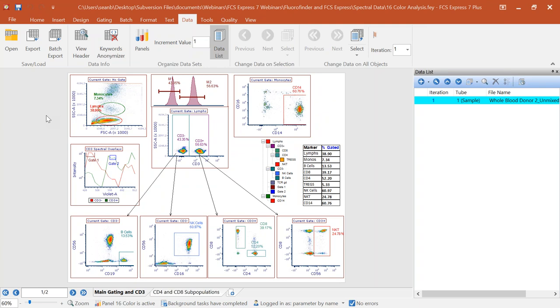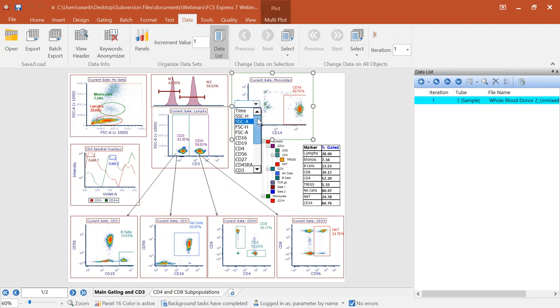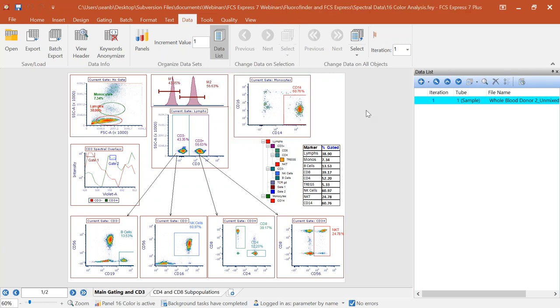The spectral data set we're going to work with today, if we look at the header for this data file, you can see it's from a Cytek Aurora. One of the most important things you're probably thinking is — this just looks like regular flow cytometry data. And it is. One of the really nice things about working with instruments like the Cytek Aurora is that the data is still going to look like you've always known it in classical flow cytometry.